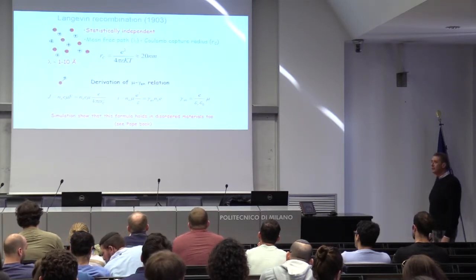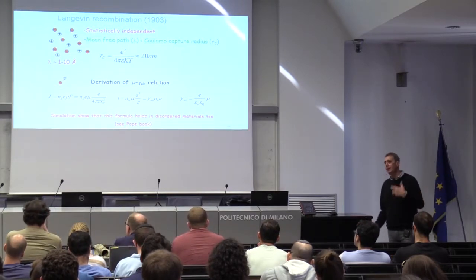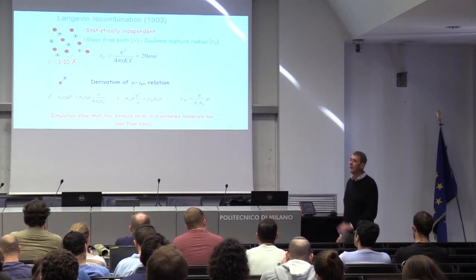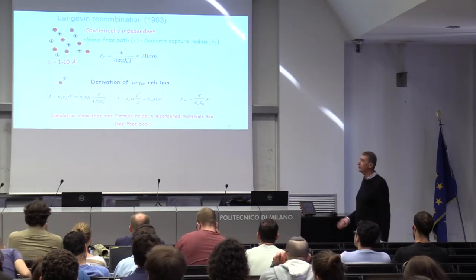You can also measure other quantities like mobility, and that is very interesting. Mobility is something that you always want to know about for applications in electronics. It's not very easy to measure, especially on a short time scale. You can do it in some situations with pump-probe.